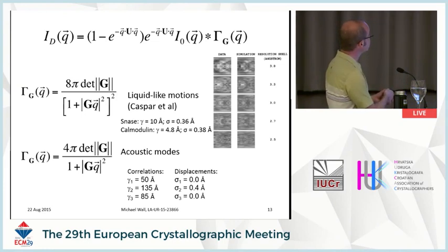The other key feature is this gamma. What it does is convolve with the squared structure factors to smear them, and this gives rise to a background pattern of diffuse features. Depending on the width of this function, you get different sized smearing in the background. There are a couple of different ways we've done this.